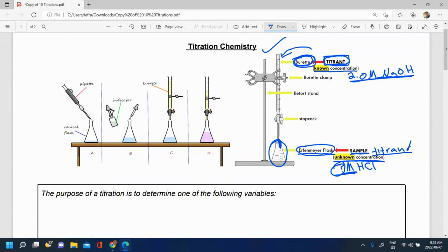To hold up the burette, you put it on a retort stand with a burette clamp, and so it just holds it in place. To control the flow of the titrant, there's this thing called a stopcock that you can turn to let things through drop by drop or using a stream.